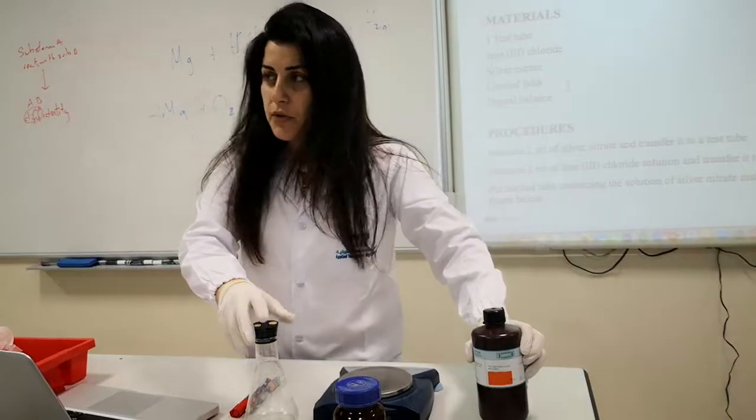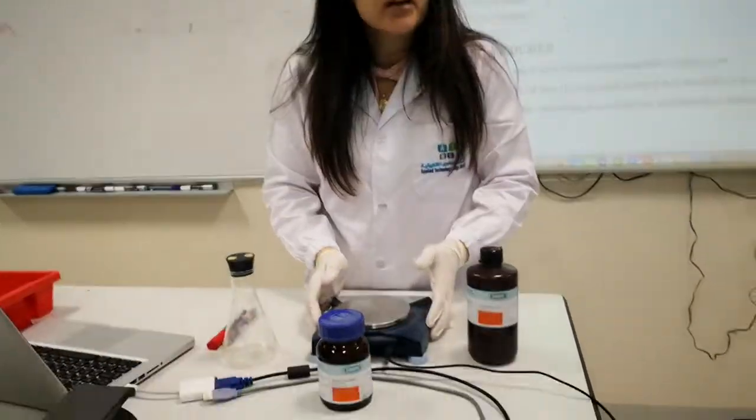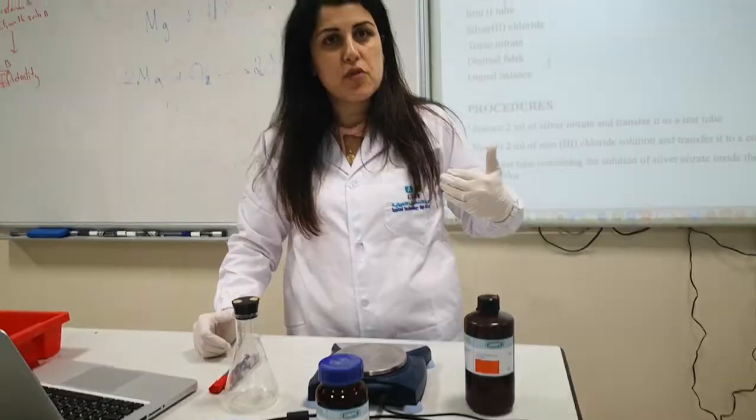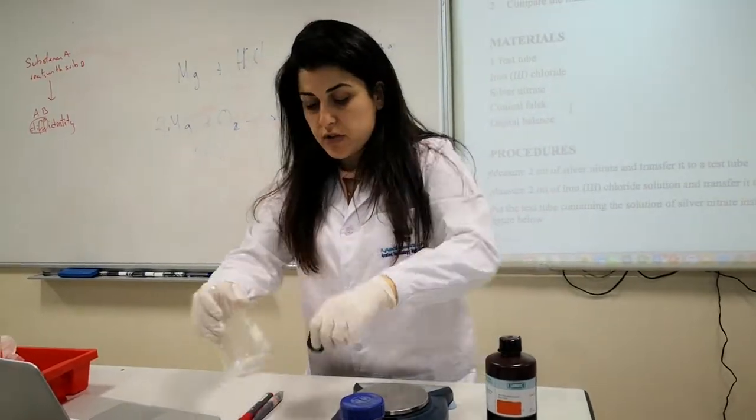Before we do that, we have here an analytical balance to measure the mass before and after the reaction.